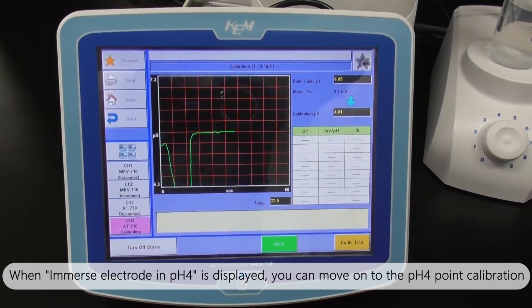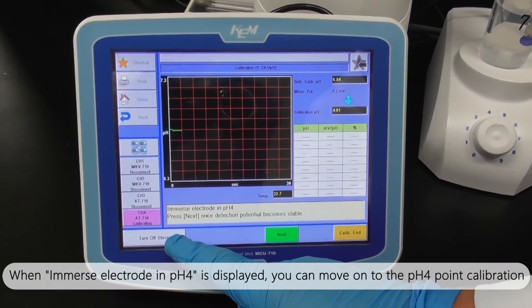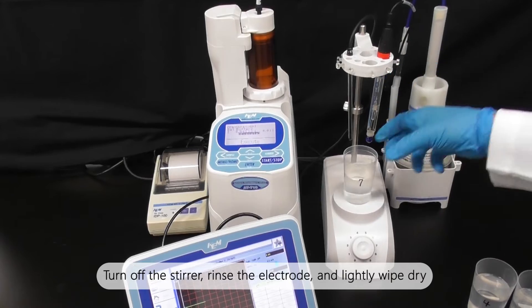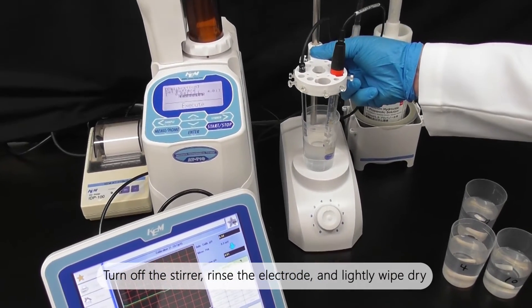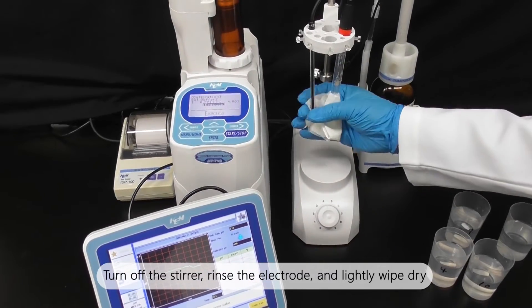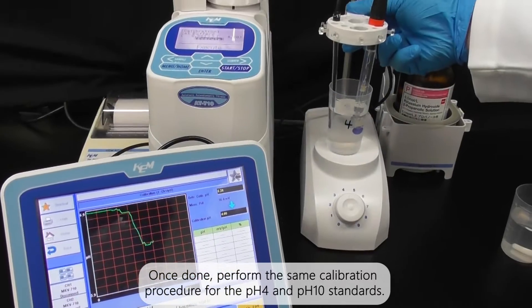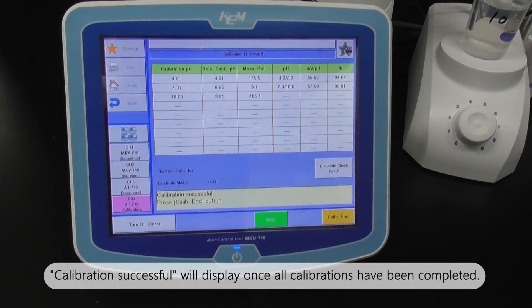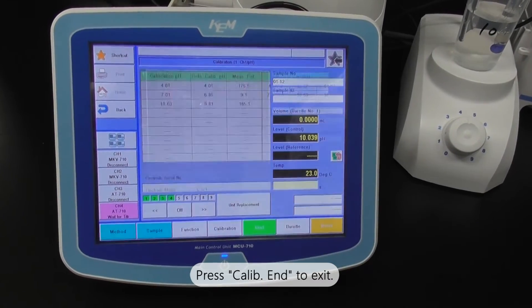When immerse electrode in pH 4 is displayed, you can move on to the pH 4 point calibration. Turn off the stirrer, rinse the electrode and lightly wipe dry. Once done, perform the same calibration procedure for the pH 4 and pH 10 standards. Calibration successful will display once all calibrations have been completed. Press calib end to exit.